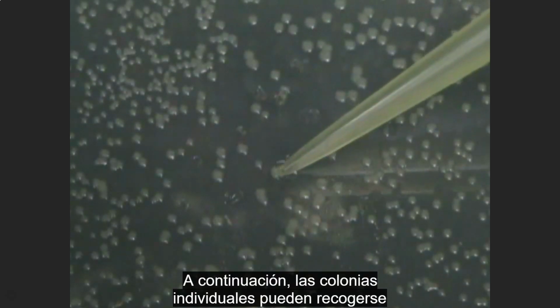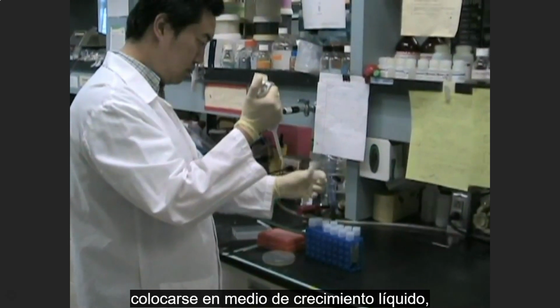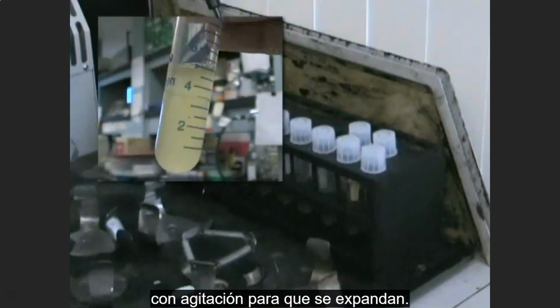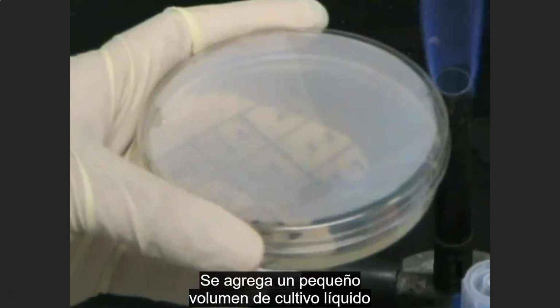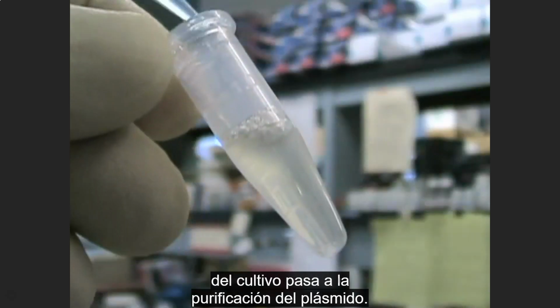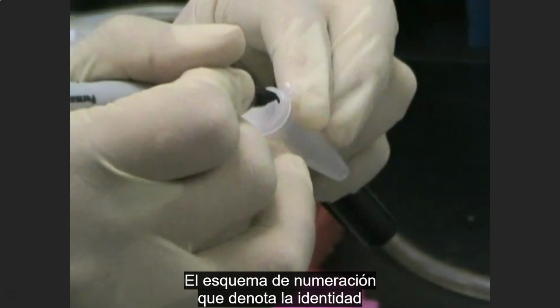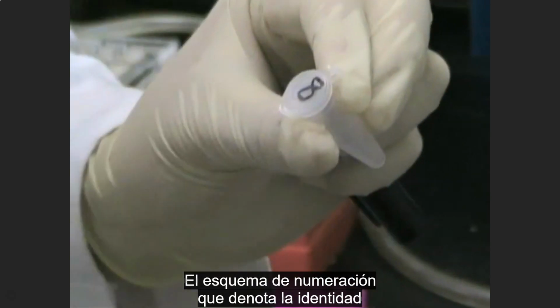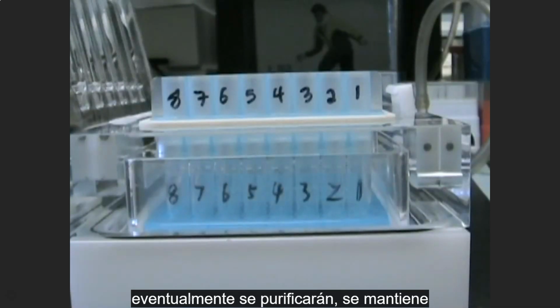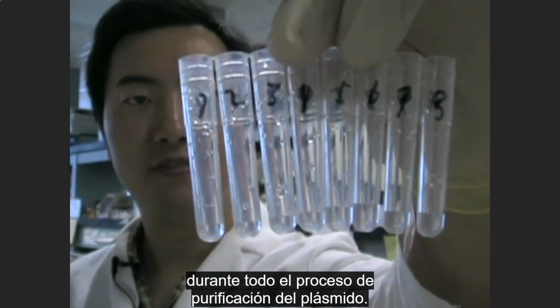Individual colonies can then be picked from the transformed plate, placed in the liquid growth media in numbered tubes, and put into a shaking incubator for expansion. A small volume of liquid culture is added to a numbered agar plate, while the rest of the culture moves on to plasmid purification. The numbering scheme that denotes the identity of bacterial colonies from which the plasmids will eventually be purified is maintained throughout the plasmid purification process.